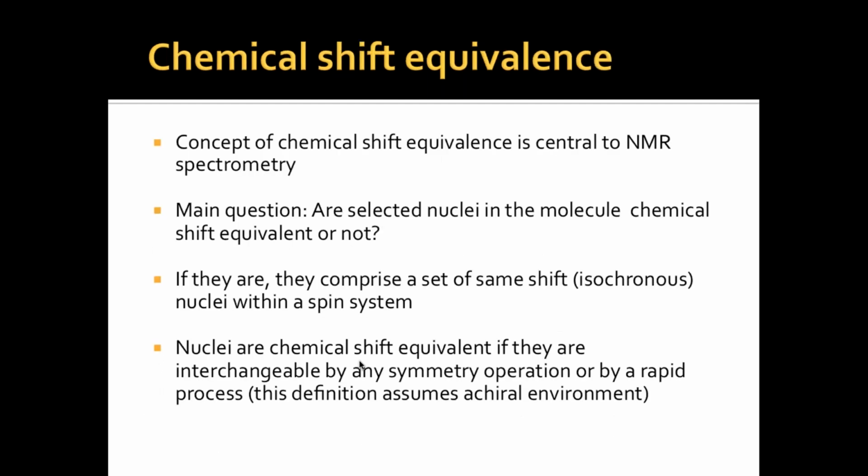Let's move forward. Now, the chemical shift equivalence. Chemical shift equivalence means, what kind of hydrogens are equivalent? How do we say that they have some symmetry or not?